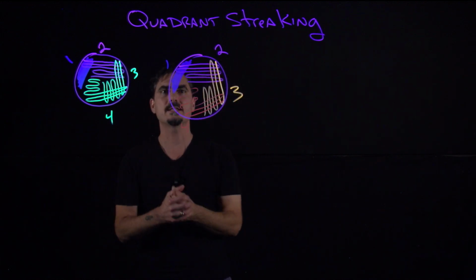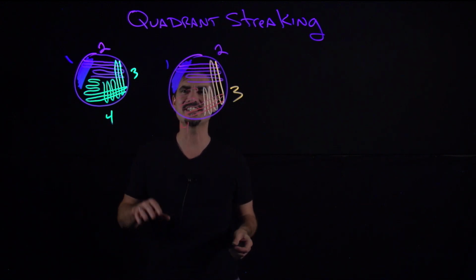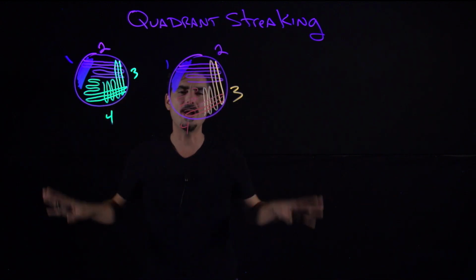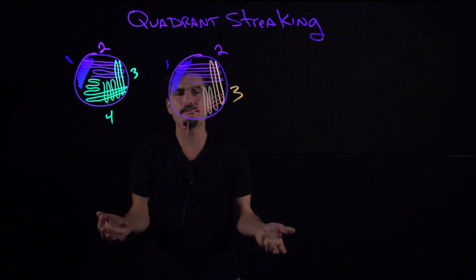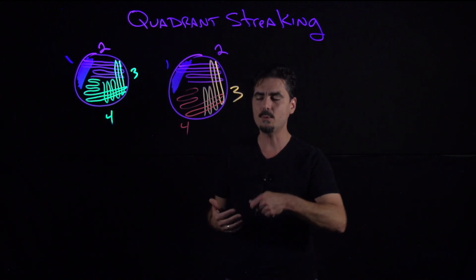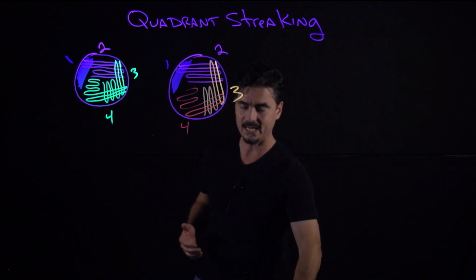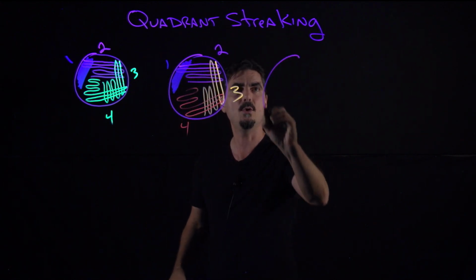Practicing with me like this, it's pretty simple. But I tell you, after teaching this for 10 years, there's a lot of ways that students get this wrong, because once you start doing it, it's so foreign if you've never done it before, right, that you need practice. And so that's where doing it on paper comes in. So let's do a couple of examples of ones that don't look good, ones that you want to avoid.